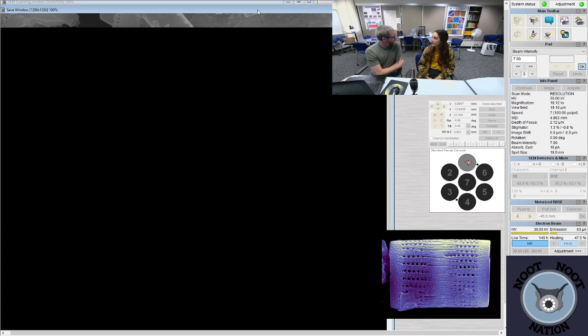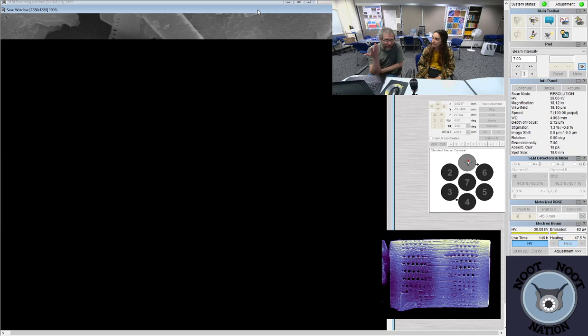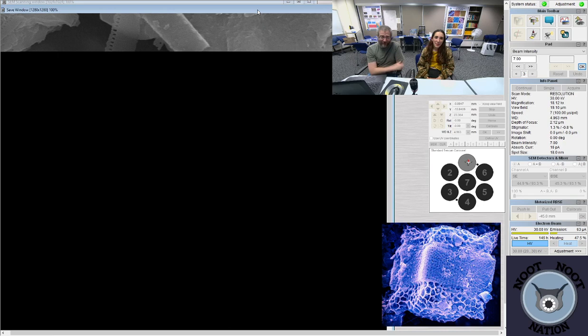Okay. I have a silver target. We could use silver. But silver is second place and gold is first place, so we're using gold. We're not going for second place here.